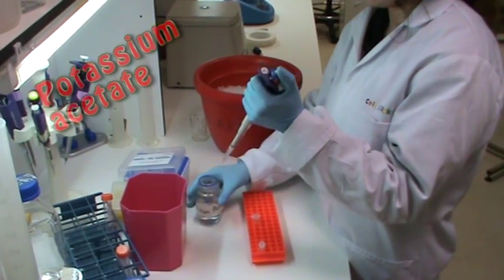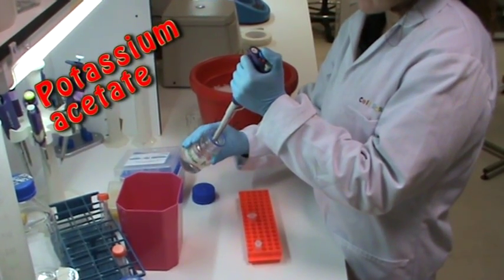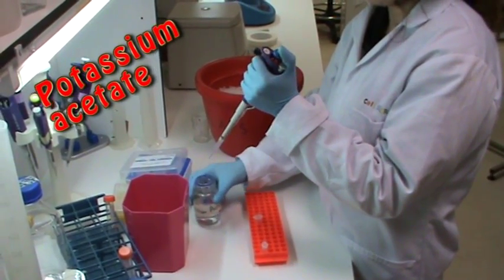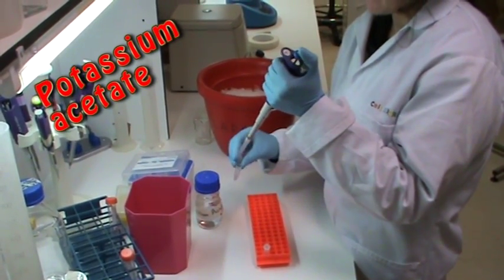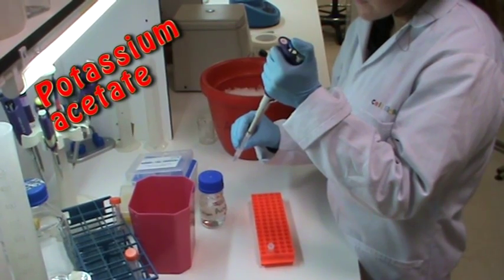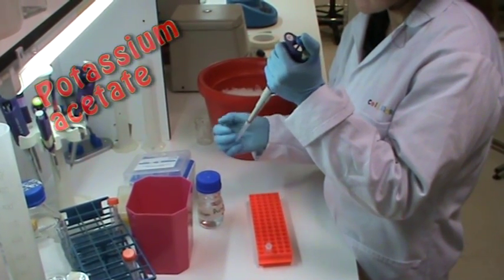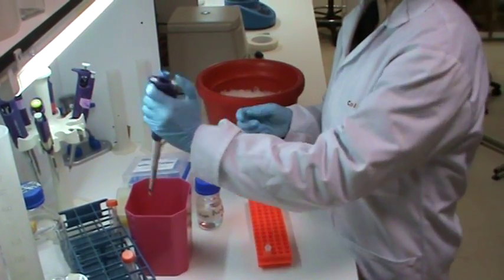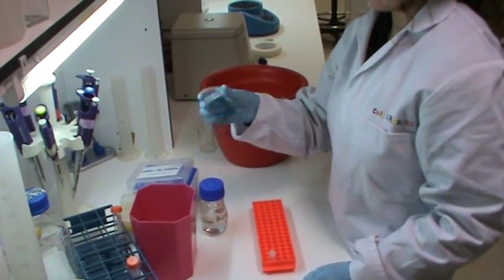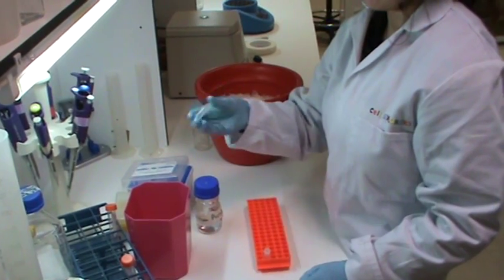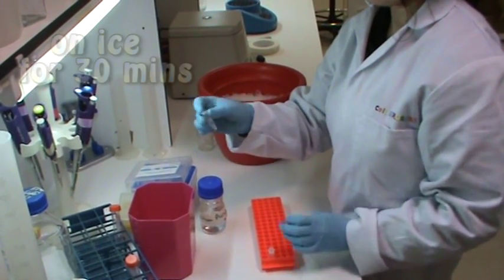I am adding potassium acetate. This is the type of salt which will help remove proteins. I will then mix it well by inversion and place it on ice for 30 minutes. Placing it on ice slows down the breakdown of the DNA and slows any further enzyme activity.